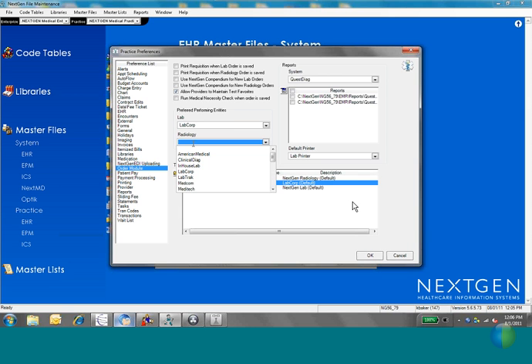Or if you have a radiology interface, you can default a vendor for that. If you have multiple vendors, you probably won't do this here unless it's like 90% of the time you use one vendor and then you sometimes have another. But most of the time you're probably going to leave it blank if you have multiple vendors so that the right vendor gets chosen when necessary.